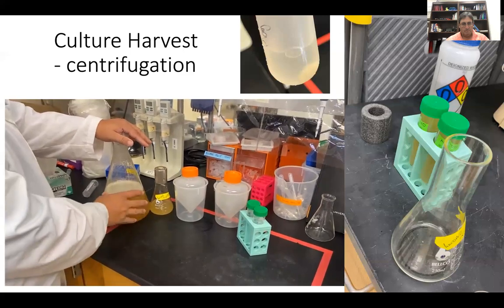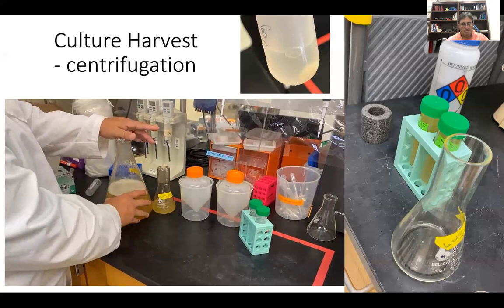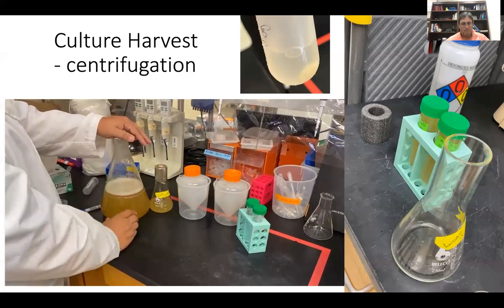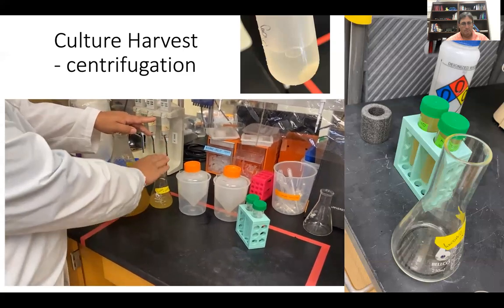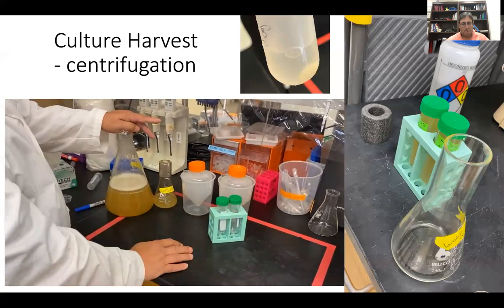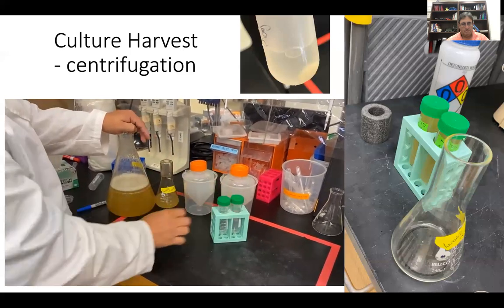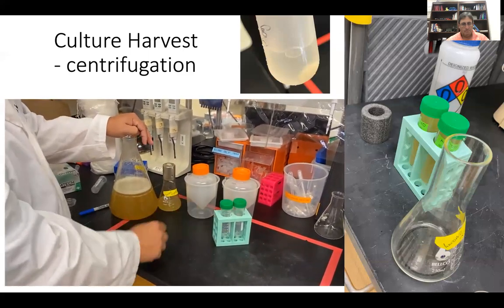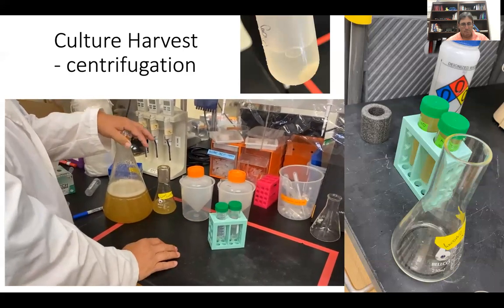There will be a little bit of remainder, so we'll pour out the resulting supernatant and then add the remaining culture evenly into these two to spin again. So we'll have the cells pelleted into these two. For the 100 mil culture, it's simple to do into the 50 mil Falcon tubes or conical tubes like this, and store them either for immediate lysis or for later by putting them in the freezer.